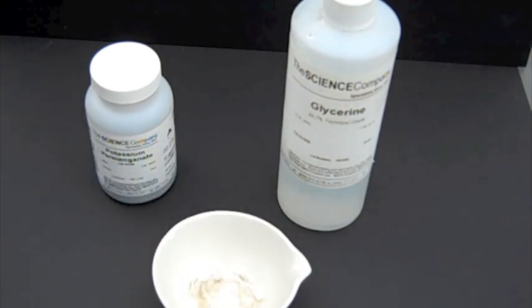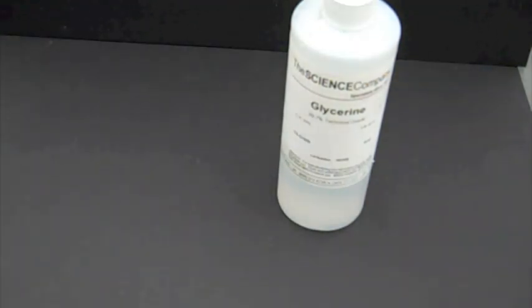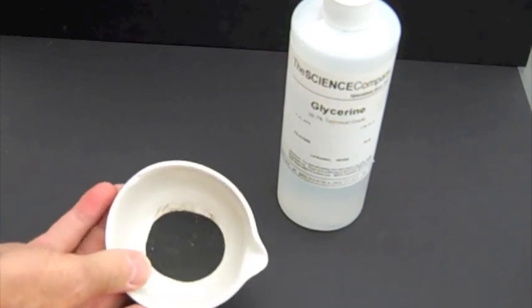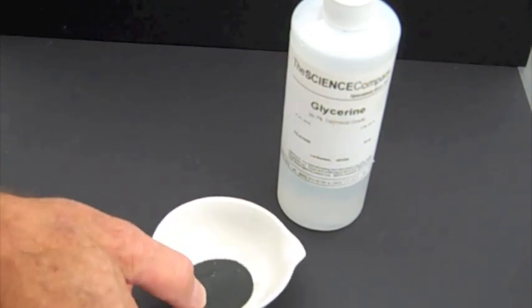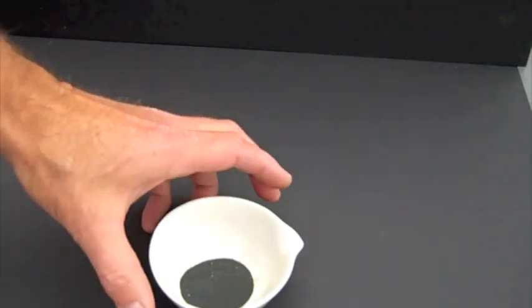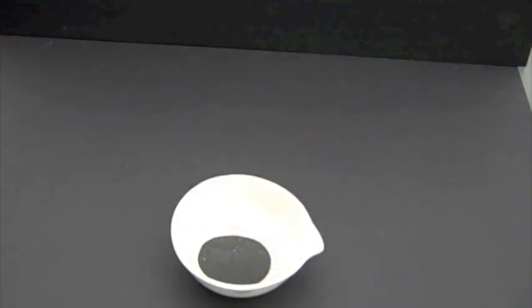start by pouring a small amount of permanganate into the dish. There it is, just enough to cover the bottom a little bit. And the next step, we'll drizzle a little bit of the glycerin onto it.